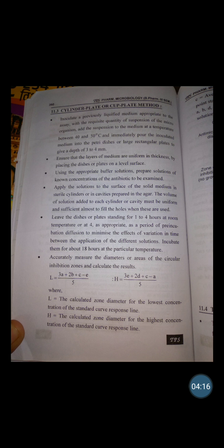Then using the appropriate buffer solution, prepare a solution of known concentration of the antibiotic to be examined.